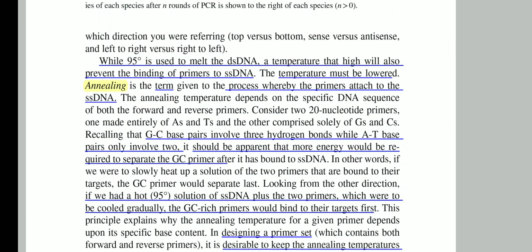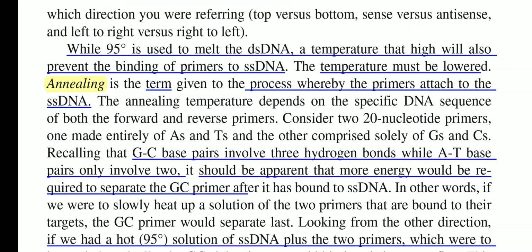Now we are having the steps. So annealing is the term given to the process whereby the primer attaches to the single-stranded DNA. The temperature is much lowered.